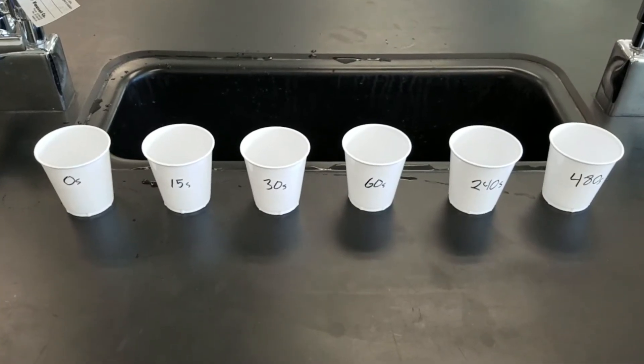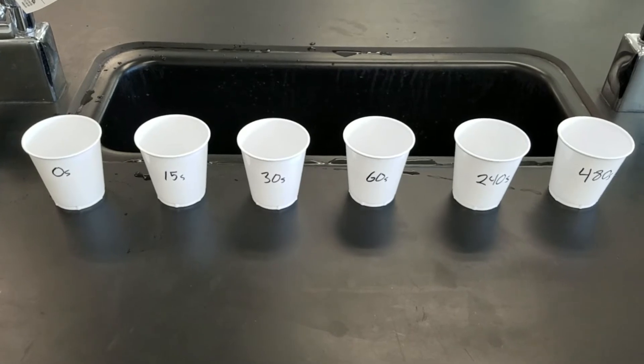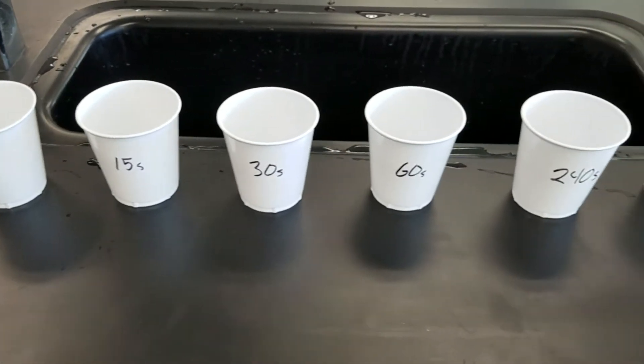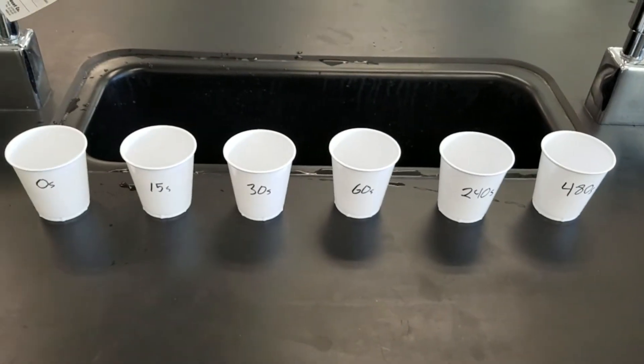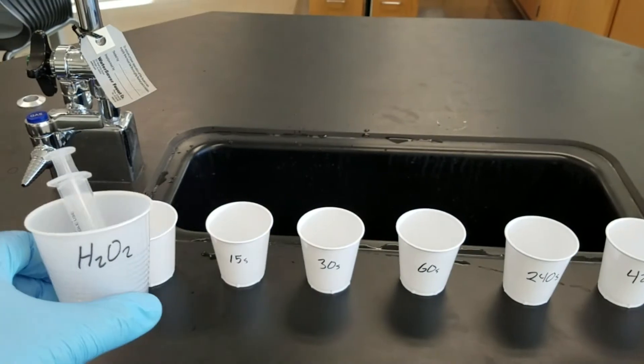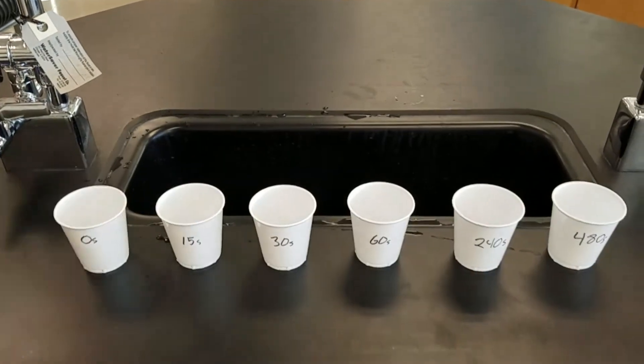When you're ready to start this lab, make sure you take the six cups with the number of seconds written on the side and arrange them chronologically just as I have done on the table so it's easier to work with. Each cup to start is going to get 10 milliliters of hydrogen peroxide.